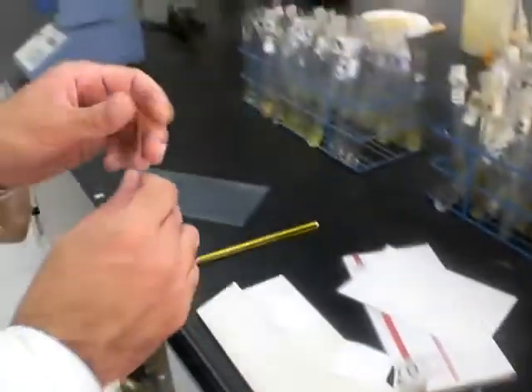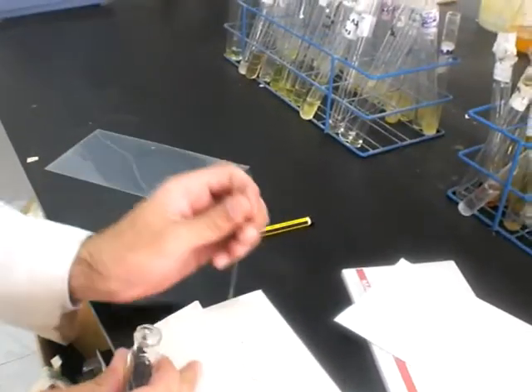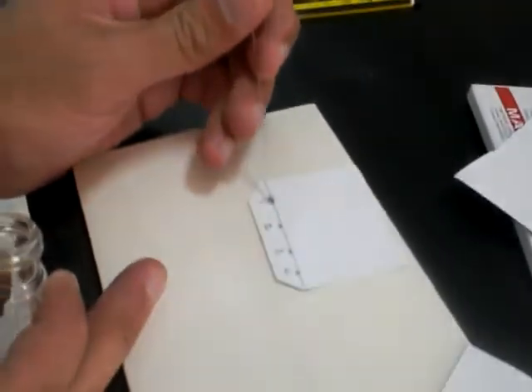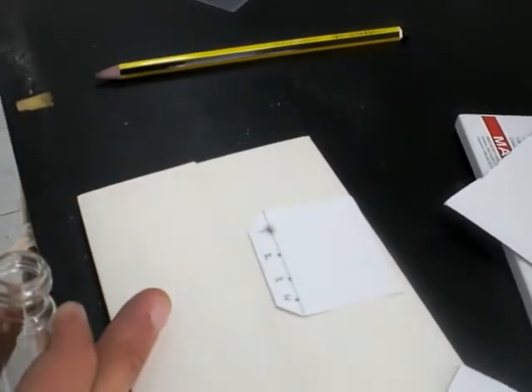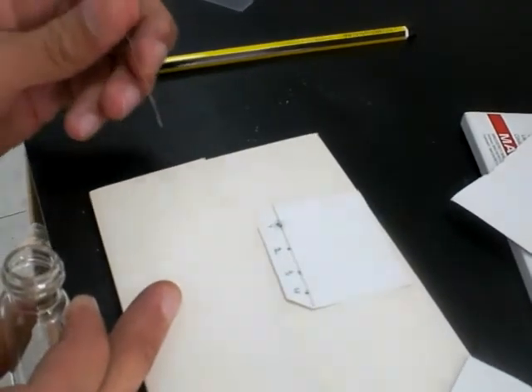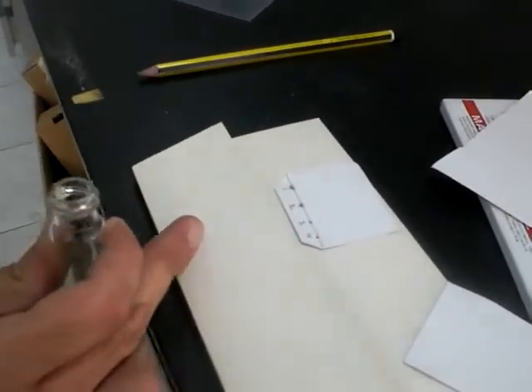Here, with a capillary like this, we want to apply the analyte spots. By capillary movement we can see the solution jumping into the capillary, then we will add a few spots from the solution, and we will allow the solvent to dry.